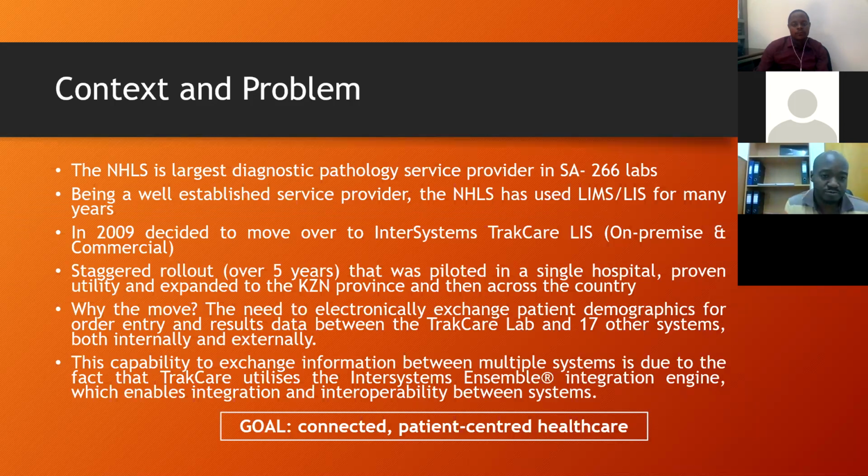Right, so moving to South Africa, it's important for me to indicate that the NHLS, the National Health Laboratory Service, is a diagnostic pathology service provider within South Africa, and it operates 266 laboratories across the country, and provides service to more than 80% of the population.